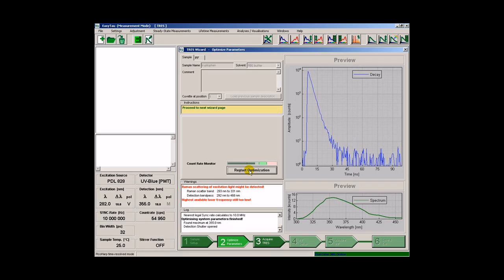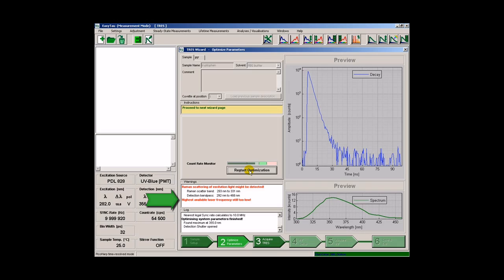When the optimizer has found the best settings for the sample, we can proceed to record the time-resolved emission spectrum. We get a warning that the highest laser repetition rate is still too low. This is because the fluorescence decay is already finished after roughly 50 ns. Therefore, we could go with a repetition rate of 20 MHz. The 280 nm LED used here, however, only supports a repetition rate of up to 10 MHz. This only makes the acquisition process somewhat slower than it theoretically needs to be. Since we cannot remedy the situation, we will ignore the warning and proceed.